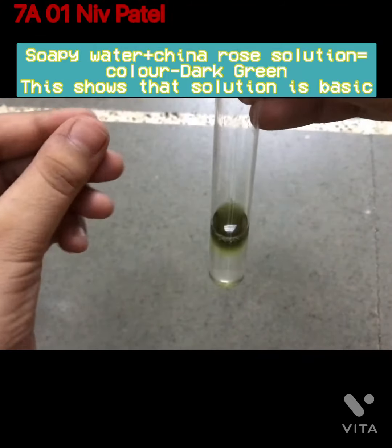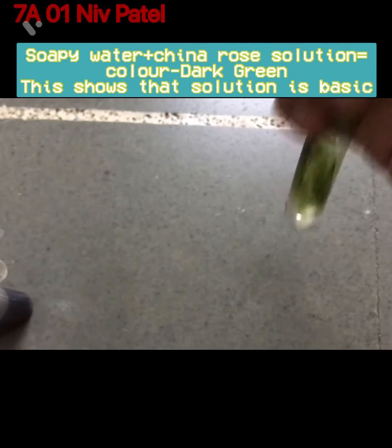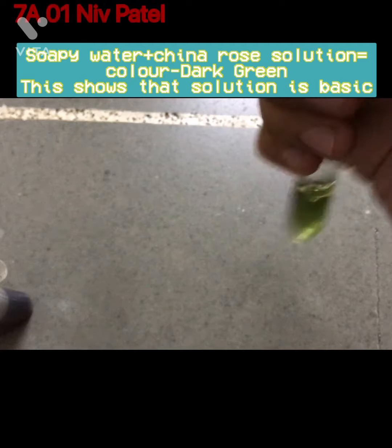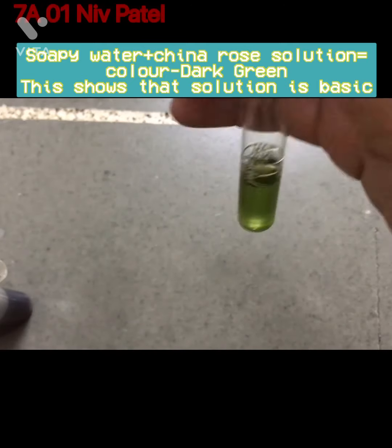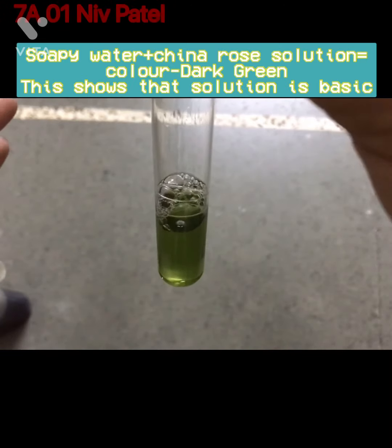Now you can see that it has got a green color. Mix it well. It has got a green color.